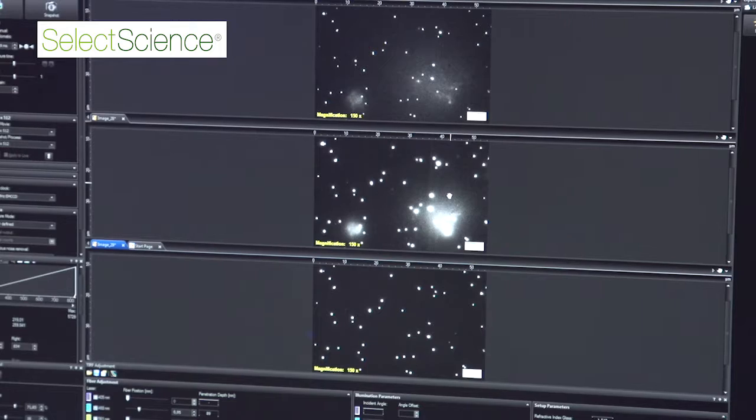In all our experiments we do freshly isolated or dissected tissue, so either from animal models or from people, from patients that are going for bypass or cardiac surgery, we get samples of tissue. So it's really important that all of those cells remain as they would have been in the original situation. So we have to be very careful with how we prepare solutions and dissect.